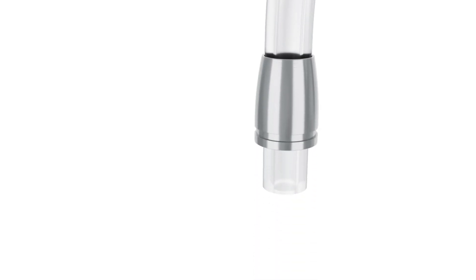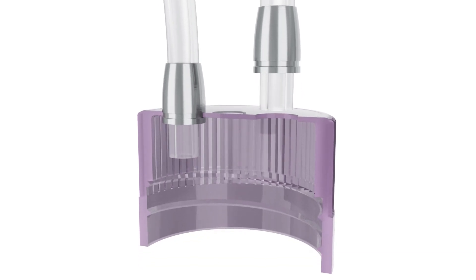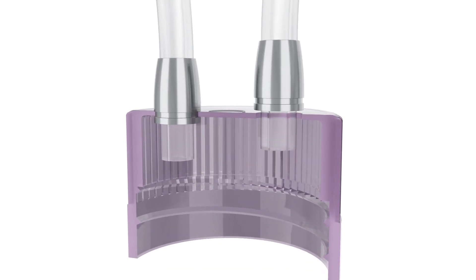The key to the versatility of MyCap is how it's produced. A specially designed metal collar is securely moulded to the outside of the tubing. The collar locks into place when inserted into a preformed hole.